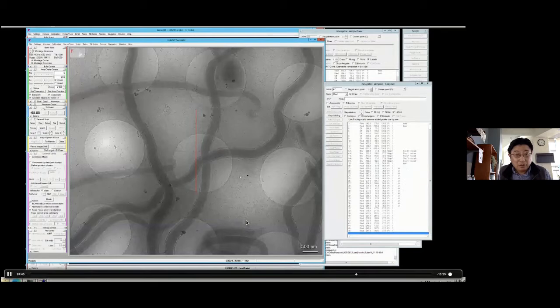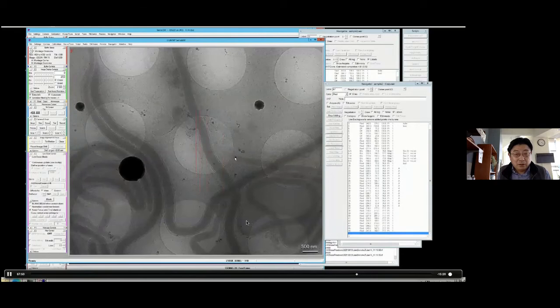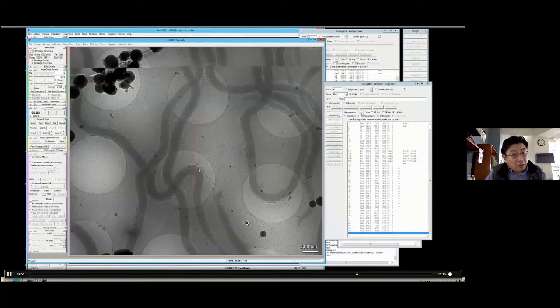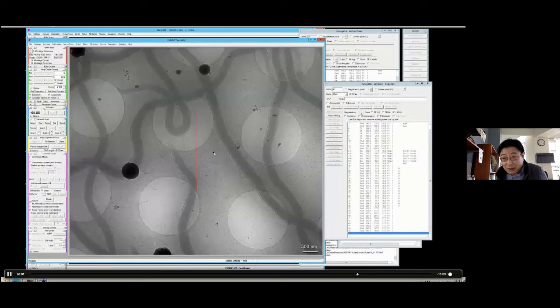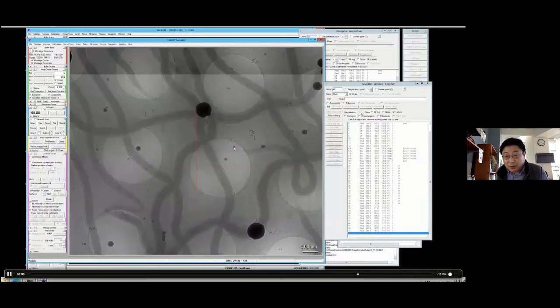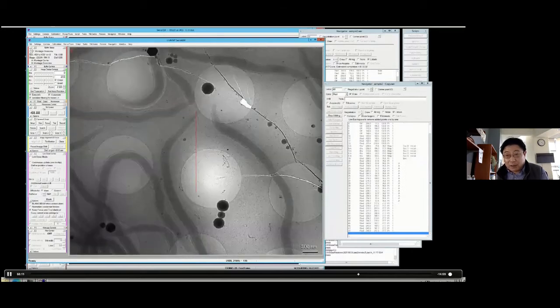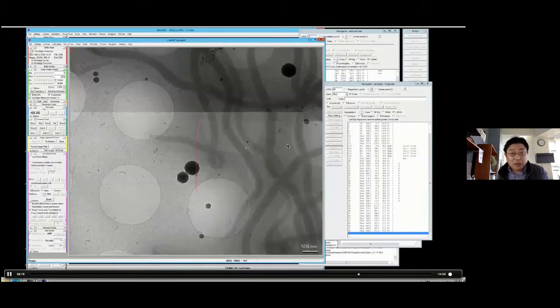We have a question. I might have missed it: do you need to do auto-eucentric for each grid square you select before you import the navigator file to SerialEM dummy? No, you don't need to, because everything is already updated. See there, this eucentricity height is already updated, because when you click the montage, it automatically updates. We only look at this montage file, so each montage file has a defined Z height, and they already incorporate this eucentricity.